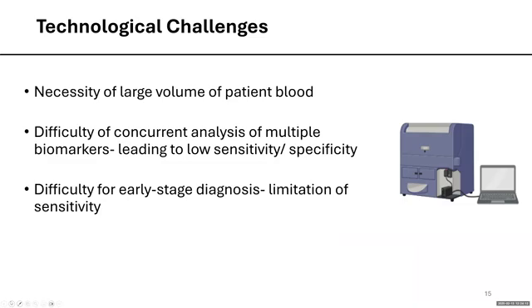And there are few challenges for current liquid biopsy, and I like to categorize those into 2 categories. One is a technological challenge, which is due to the current technology, and one is a biological challenge, which is due to the challenges of biomarkers for cancer. So limitation of current technology, if we look at, they need very high purity of sample. Then they also need high yield of these biomarkers from very low biofluids. That means you need very high blood volume.